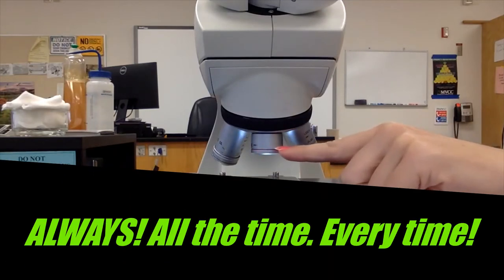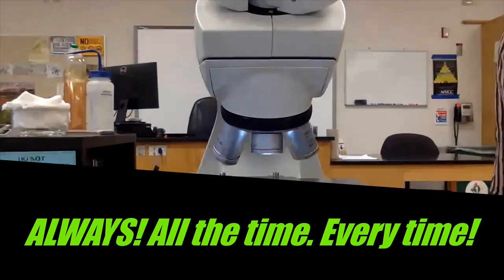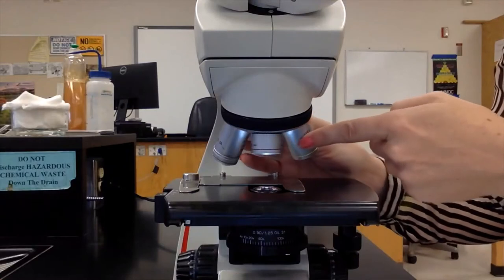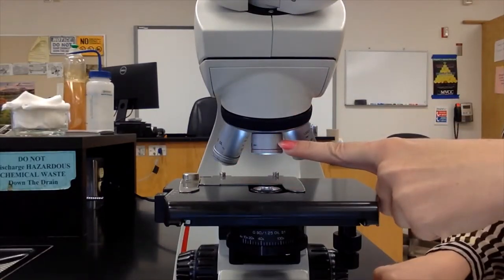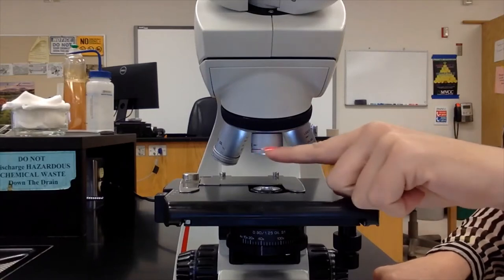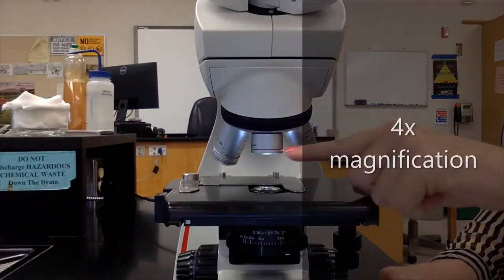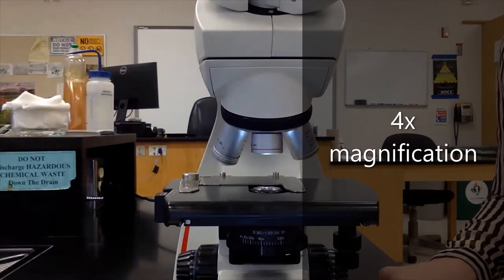You will always start with the scanning objective lens. That's this one here that has the red band. If you look at the barrel of the lens, it tells you that it has a four times magnification.